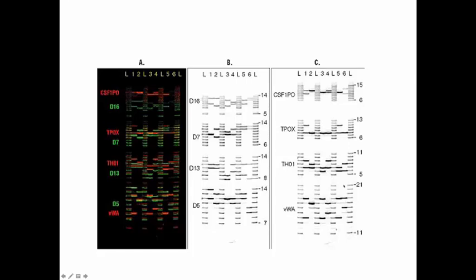And if you then go to THO1 for person number 6, at THO1, there are 2 bands here. And that's going to correspond to 5, 6, 7, 8 right here. 9, 10, 11 if they're higher. So this person would have a 9 right here. So between 5 and 11 repeats. So person number 6 for THO1 would be put into the system as a 6, 8.